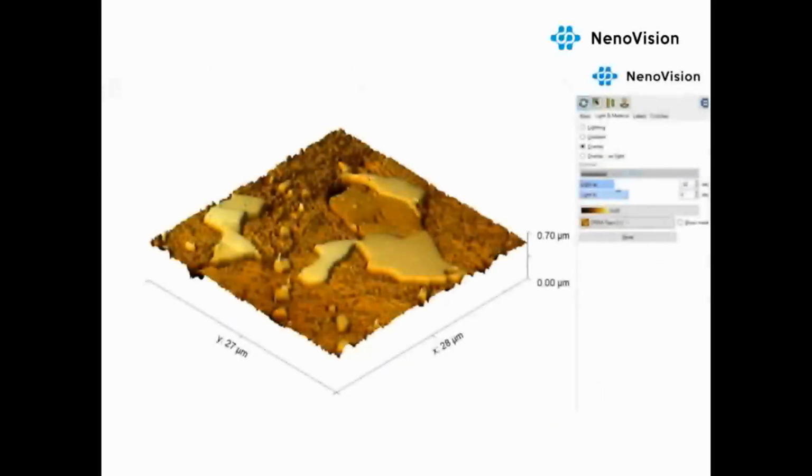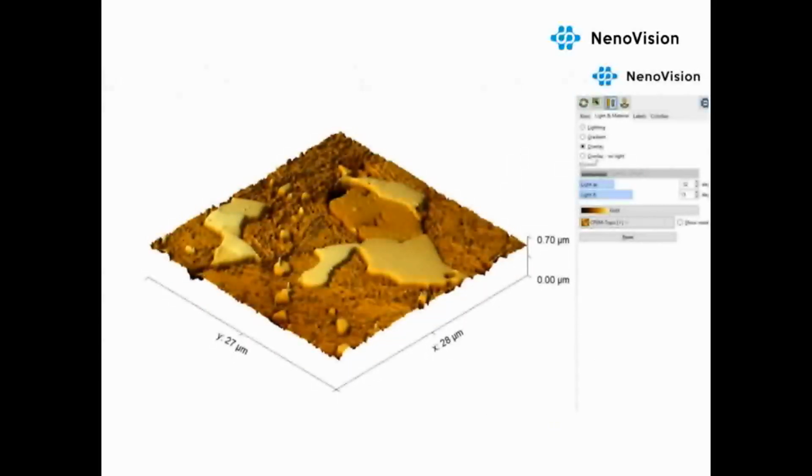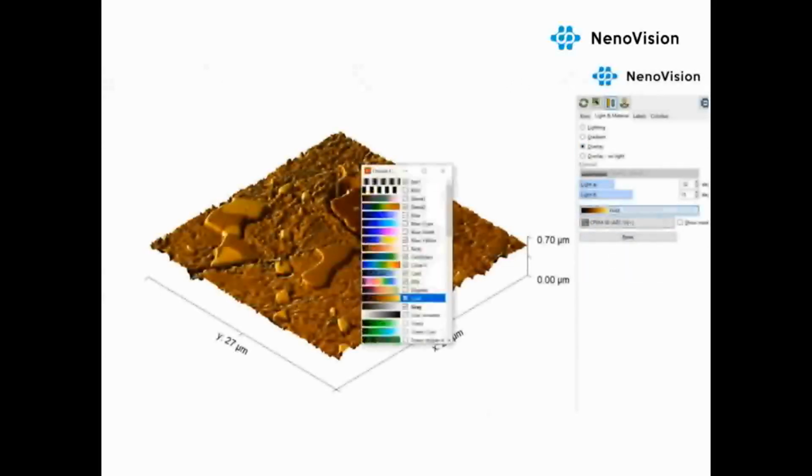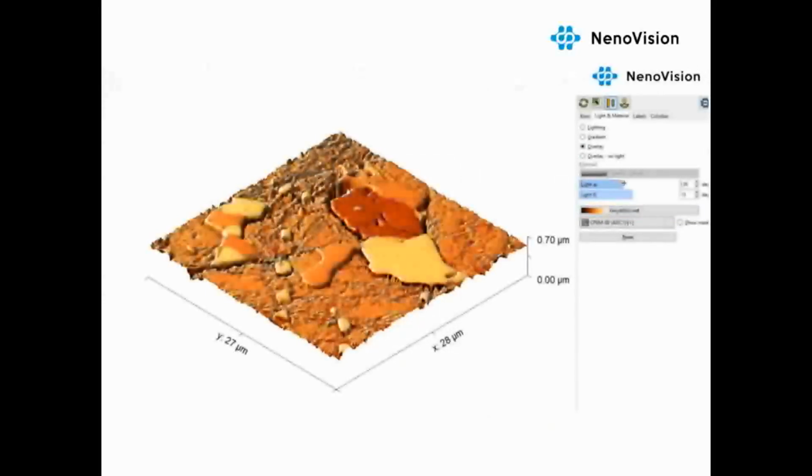In the last step, the adjusted images are merged into the three-dimensional CPEM view. In this case, the AFM topography was combined with the SEM data, which here can be either SE or BSE signals. And this was to demonstrate, in short, the CPEM technology in real use.